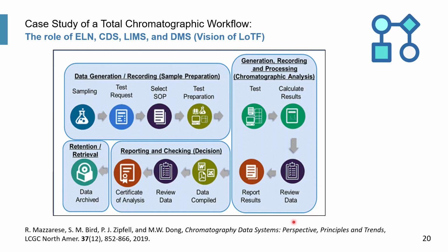This is a futuristic slide, a figure, to demonstrate a vision of the lab of the future, right? Shown here is the integration of all these different pieces, such as electronic notebook, CDS, LIMS, and data management system, to allow you to have the vision of a paperless laboratory where everything can be done electronically with automatic transfer of data, right? So from data generation, recording, archival, report, into archival and the automatic generation of CoA.